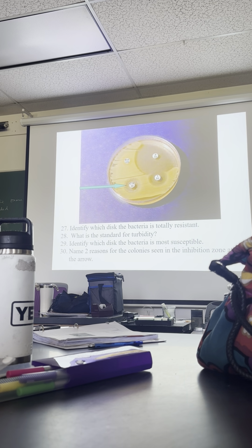Very good. The other thing is, for us, I'm not going to ask you to measure. We're just going to say that if there's a nice big zone around it, then it's sensitive, without measuring it. It's not the best way to do it, but I'm trying to get concepts out of you, not perfection, right? So if it's got a big zone, then it's sensitive. If it's got no zone, then it's resistant, yes?